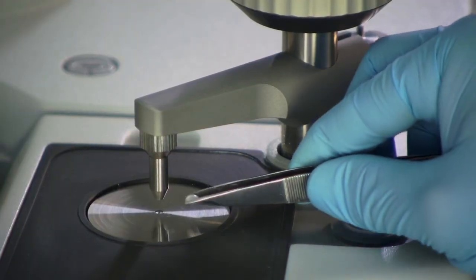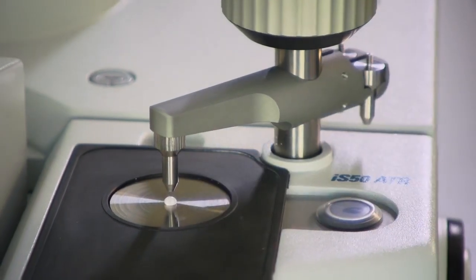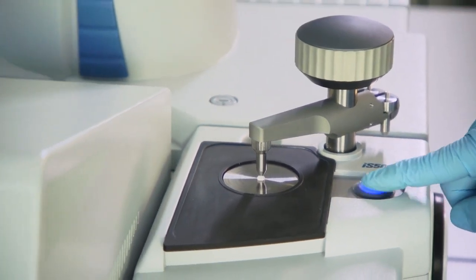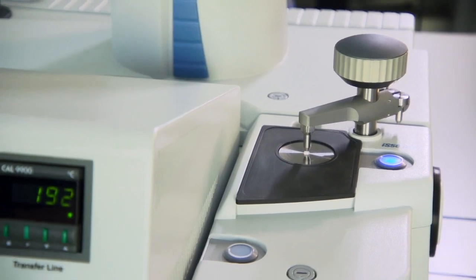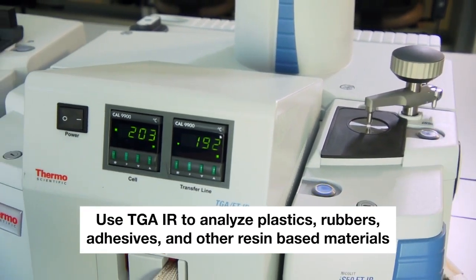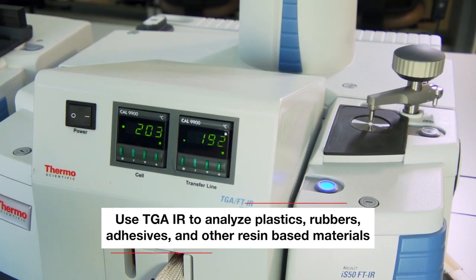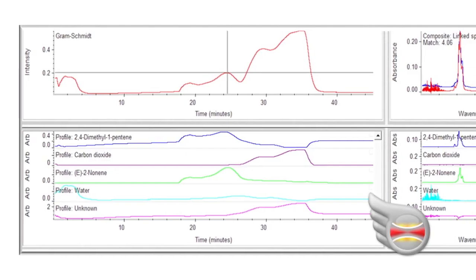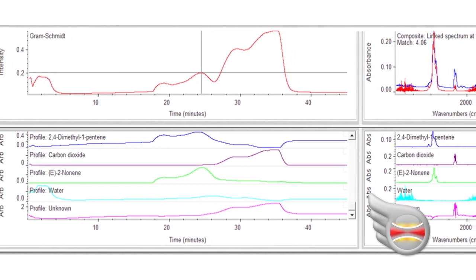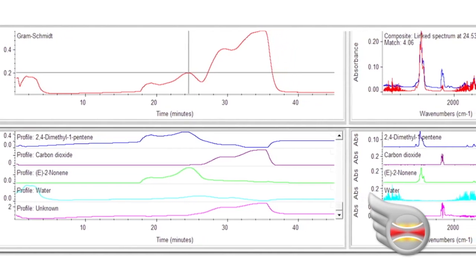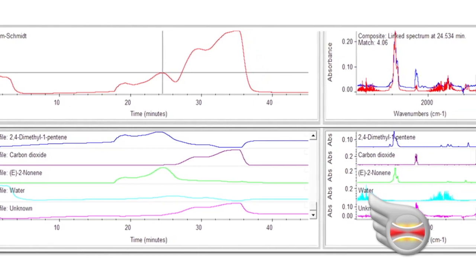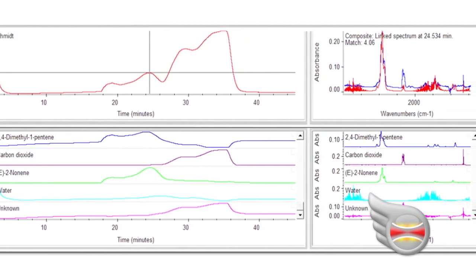For formulation studies in materials development, reverse engineering, or root cause analysis, the Nicolet IS-50 TGA module makes it easier than ever before to use TGA-IR to analyze plastics, rubbers, adhesives, and other resin-based materials. The Omnic Mercury software automatically identifies all evolved gases from a TGA experiment, eliminating manual operations that once took hours and the skill sets to interpret data.